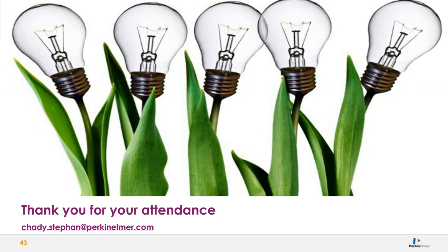We have another silicon dioxide question. What is the recommended internal standard for silicon dioxide?